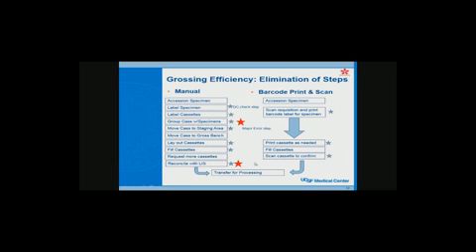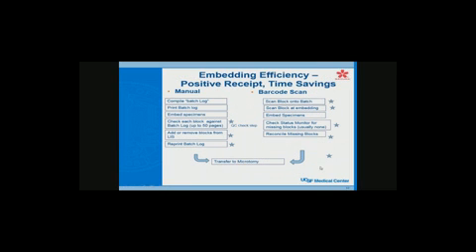If you do have to do central printing, then you do have a process of scanning the cassette along with the container in order to confirm that they match. If they don't match, then you can't go on. And then at the end, we have reconciling all these cassettes with the LIS, which often happens with a batch printed report, a paper report that you have to check off cassettes. While in the barcoding process, we scan the cassette to confirm that we got it. And then all we look for is things that are left over rather than checking every single one.